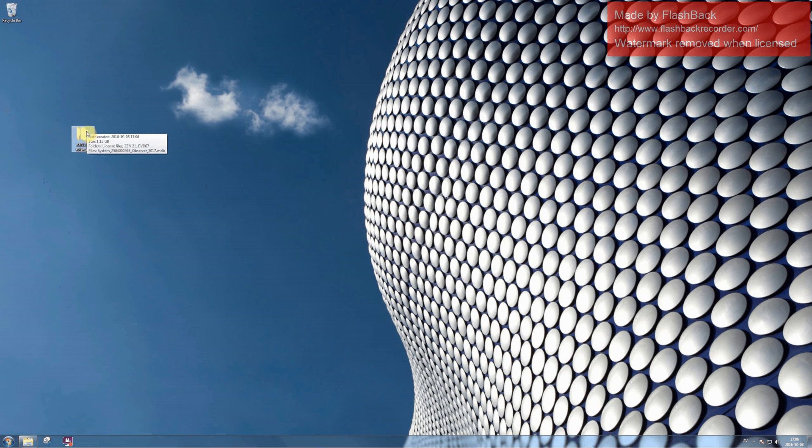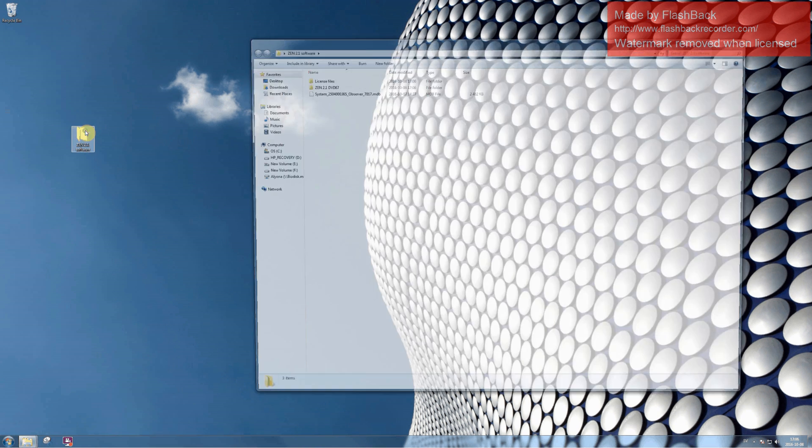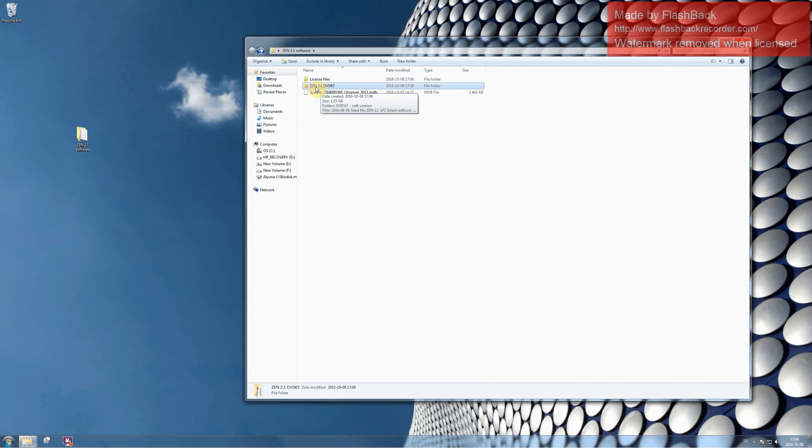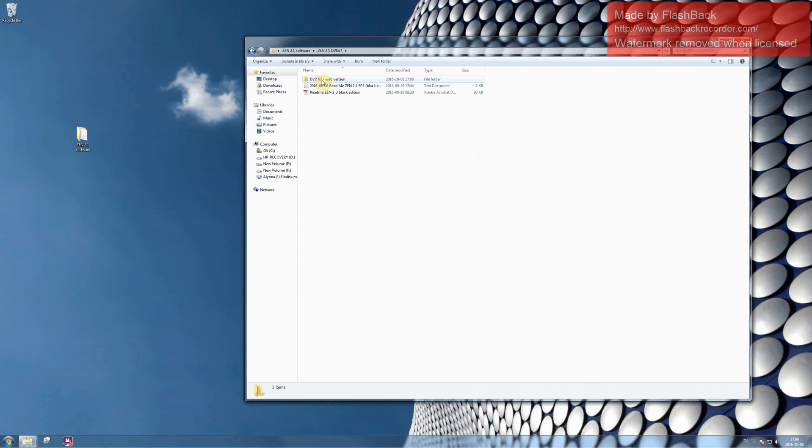Open the folder and proceed to the file called dvd67 or to the file called setup. Double-click on this file.